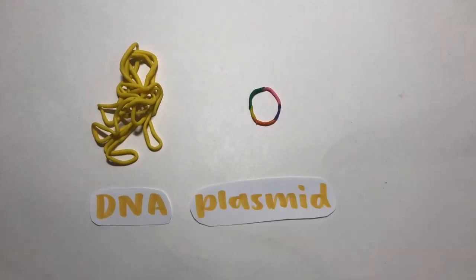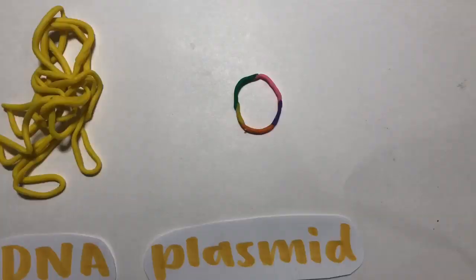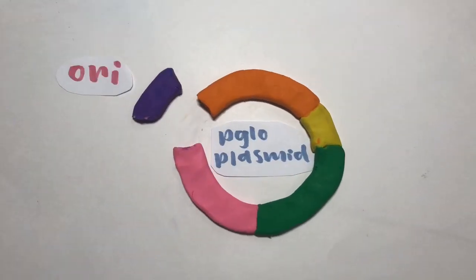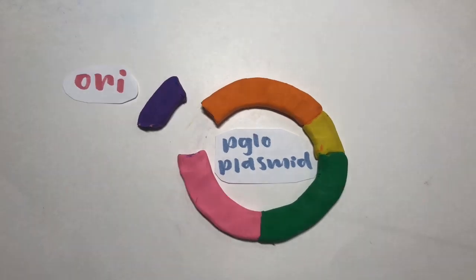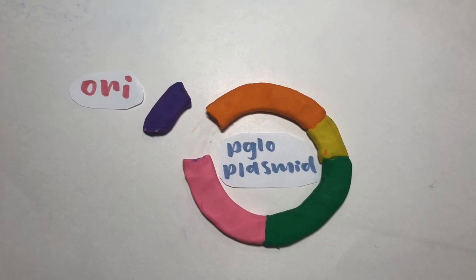Bacteria have two different kinds of DNA. So one circular chromosome, which in E. coli is going to be 4.6 million base pairs, and then plasmids, which are smaller, such as the plasmid we're using today, about 5,000 base pairs. Plasmids are how bacteria transfer information such as antibiotic resistance to each other.